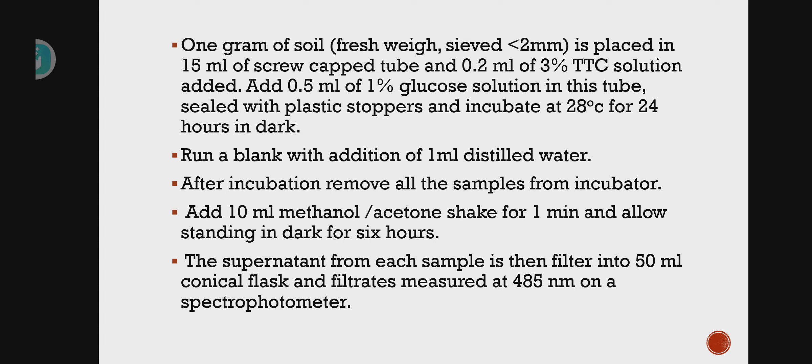To start the procedure: take 1 gram of fresh soil, add 0.2 ml of 3% TTC solution and 0.5 ml of 1% glucose solution. Then seal the bottle properly and place it for incubation for 24 hours in the dark.